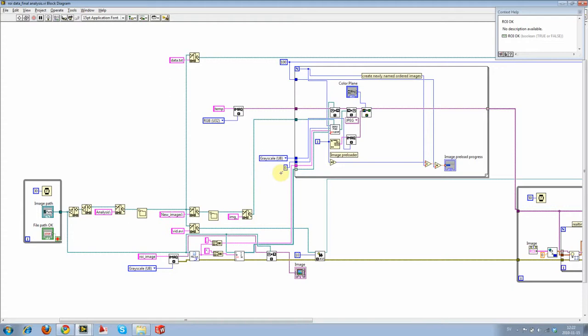Now, if you accidentally wire the wrong strip path or build path the wrong way around, things end up in the wrong folders. But these are trial and error based operations. We can only try to get it right the first time, but most of the time we have to make modifications on the fly. Okay, well, I will go through it in the class.